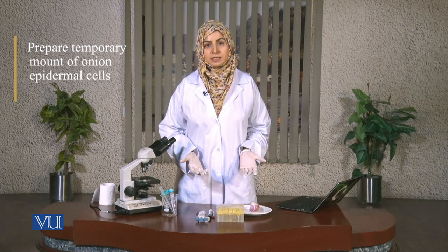Hello everyone, welcome to the online practical class of Virtual University of Pakistan. In this session we are going to talk about the preparation of a temporary mount of onion epidermis. This is an example of a plant cell. We'll go through this step by step. In the beginning I'll tell you about the equipment and the consumables that will be required.